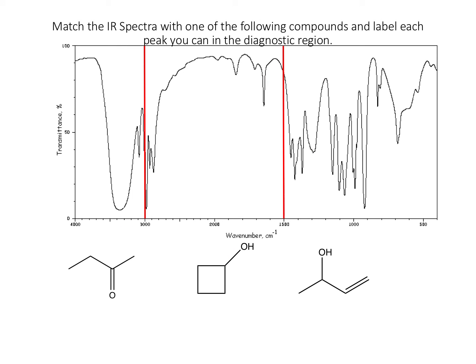Same three molecules and a third spectrum. When I look at the double bond region, this peak is not super intense, so I might ask whether that's noise or something real. Now, if I have a carbon-carbon double bond, that means I have SP2 hybridized carbons. If they have any hydrogens attached to them, I would expect to see a peak at 3,100 wave numbers due to the CH stretch from those SP2 hybridized carbons — the hydrogens coming off here and here and here. And I do see that. So I might have been unsure whether this was noise or actually a carbon-carbon double bond, but the SP2 hybridized CH stretch helps me be confident that I am seeing a carbon-carbon double bond.